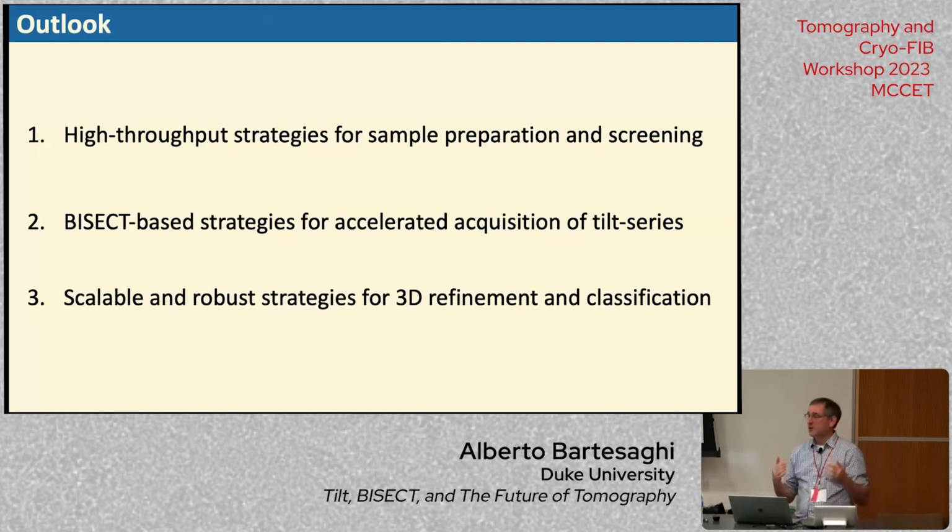We can actually collect data using BISECT or similar techniques in parallel in high throughput mode. And then if we have these scalable and robust strategies for 3D analysis, I think these will be the three ingredients that will actually allow this technique to move forward.